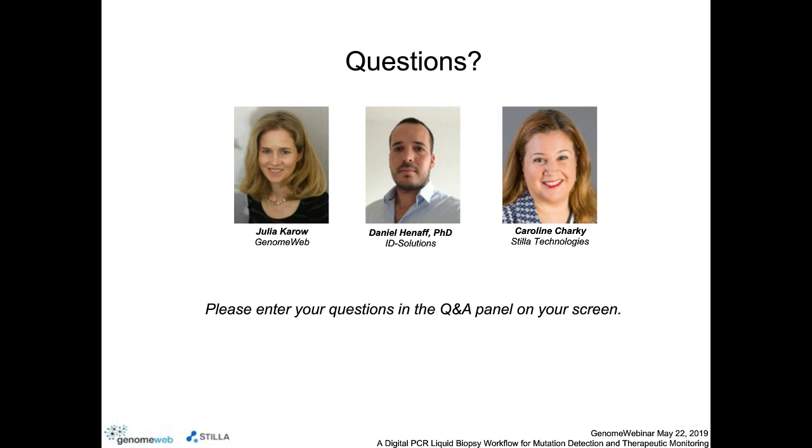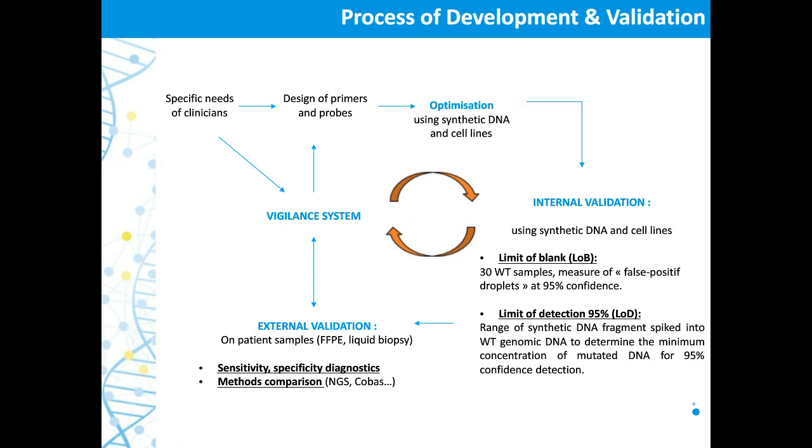And this depends also on the sequence of the DNA. If it's like the third assay, which is GC content, up to 80 to 100% of GC in the sequence, it's more difficult to develop.